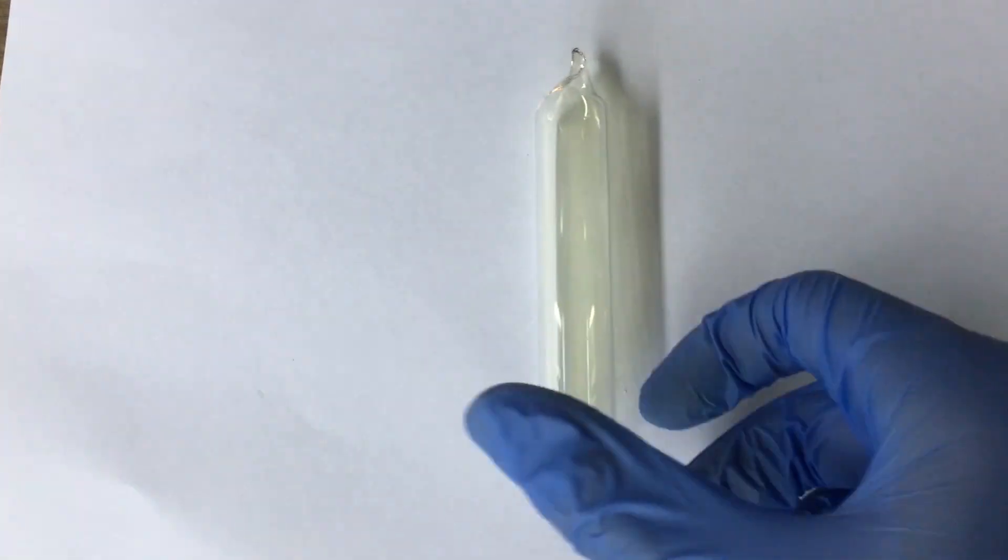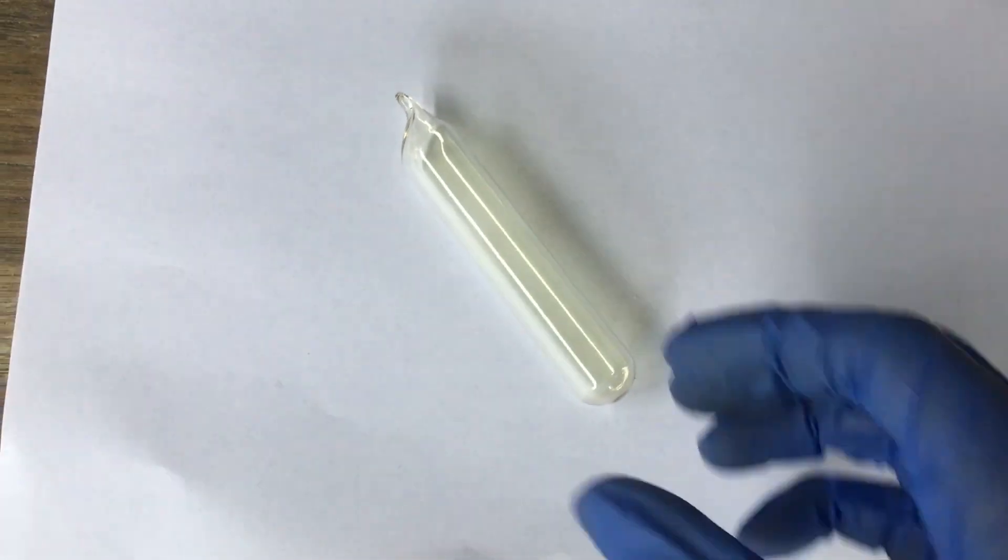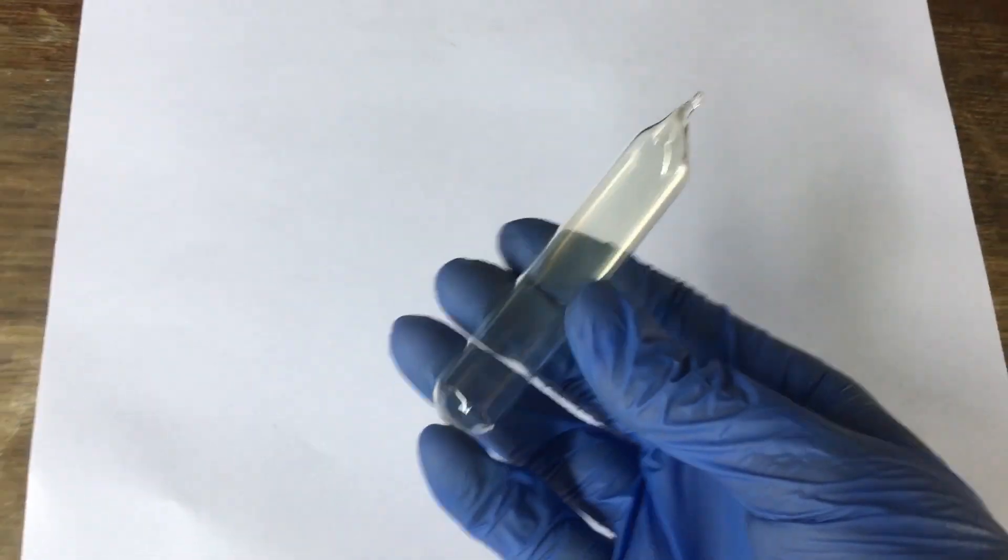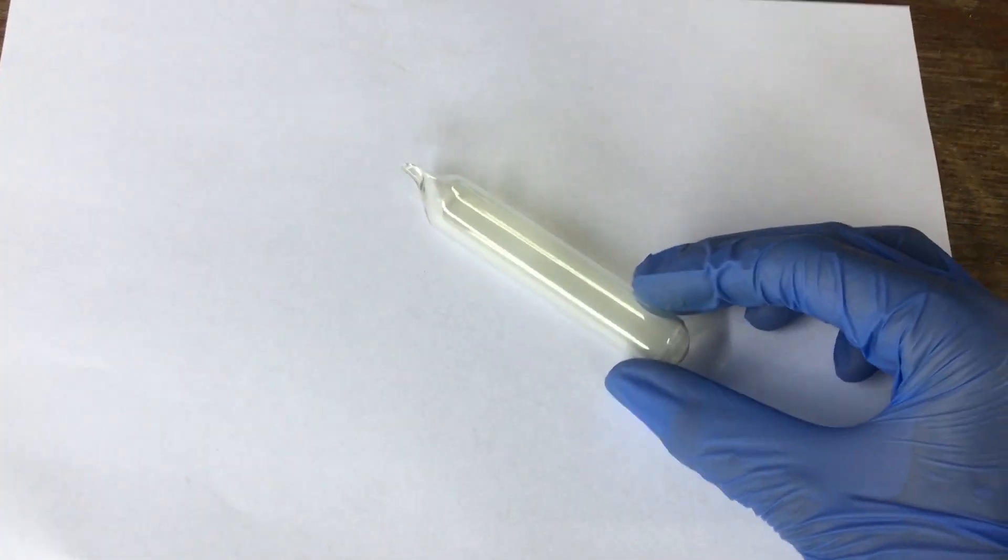And you can see, if we put it on a white background, it's definitely that greenish yellow color of chlorine. We do have chlorine sealed in this ampule, which is exactly what I wanted.